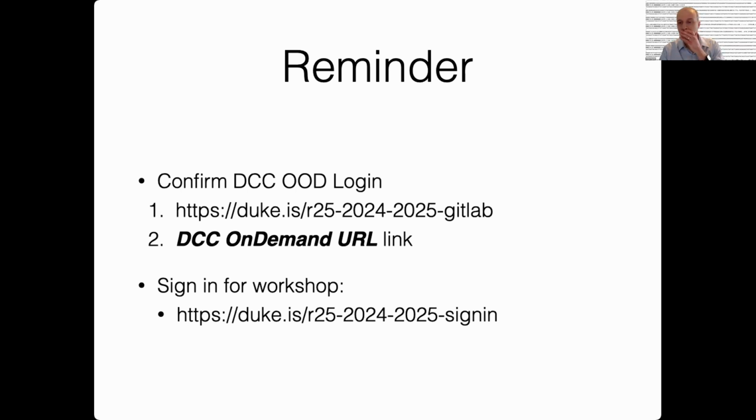Just for people who don't know, the GTF and GFF are annotation files. You need a reference genome to find where in the genome sequence the read is mapping.